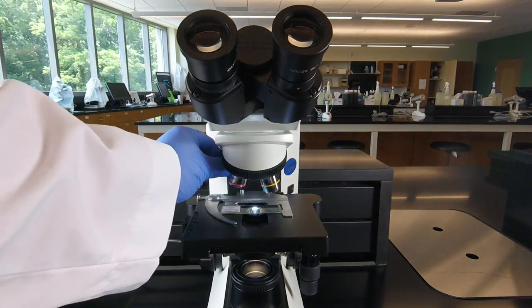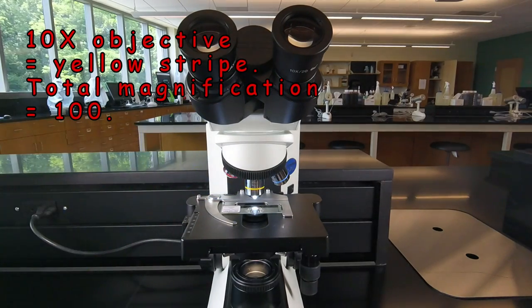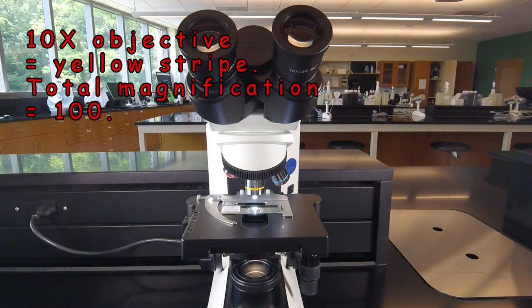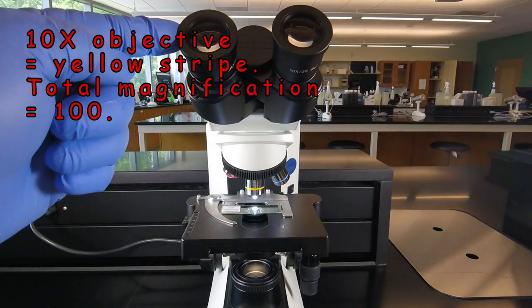Now we will occasionally use the 10x objective, and that's one that has a yellow stripe around that. We click that into place. So now the total magnification is 10 of the objective lens times 10 of the eyepiece.